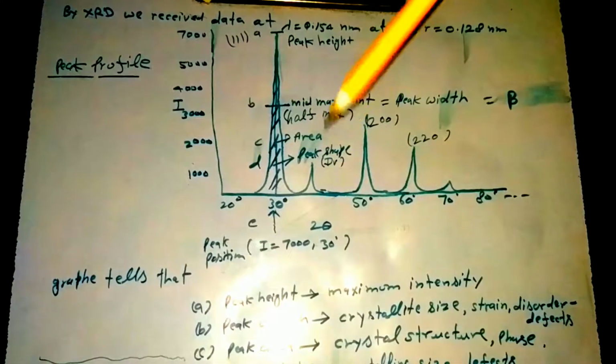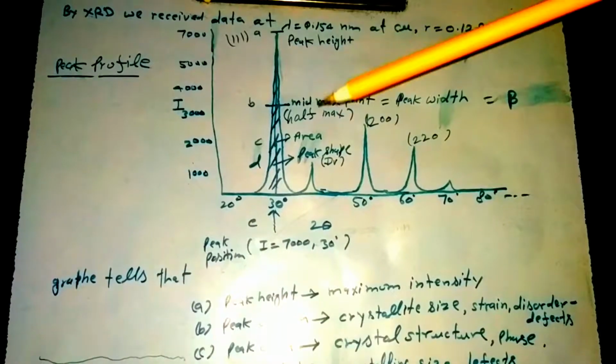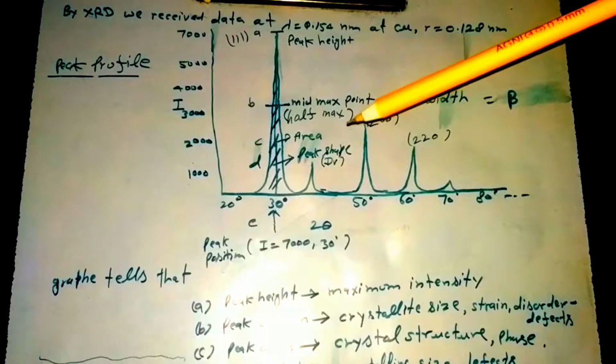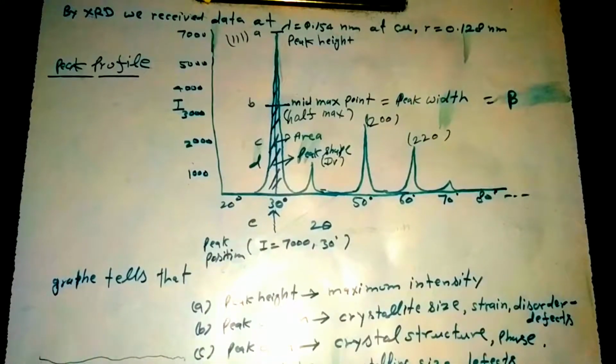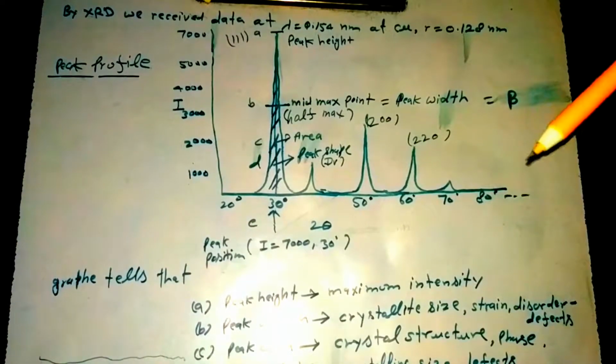This is a graph of angle and the intensity of diffracted X-ray on the crystallite sample. These fluctuations are just like the fingerprint of the sample. These fluctuations, these peaks, tell everything about the composition of the crystalline, its atomic packing, the arrangement of atoms, the size of particles, and the disorder, defects, crystal structures, phase, and many things.